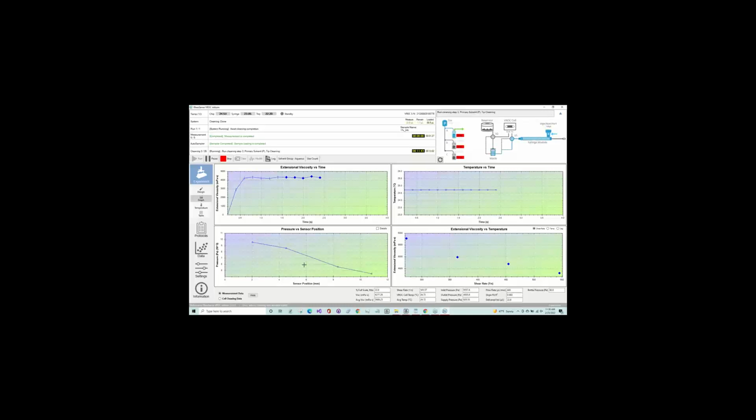Okay, so just to make a final comment on the initium, we could have used the auto sampler for this sample and many others. It's just in the interest of time, we were doing the manual injection, which of course, if you have tricky samples, is doable on the initium. So if you have the interest with the m-VROC, it's now compatible on the automated system, and there's certainly plenty of advantages for that. So now we're going to move over to the manual unit, just so that you can see the other options that are available to you for this type of extensional testing.